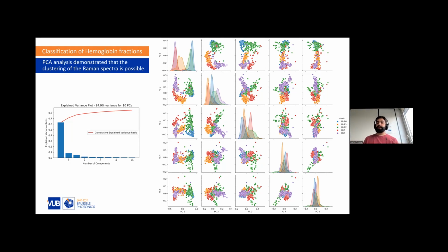For example, if you have a spectrum which has 1,000 data points in it, it gets those 1,000 data points and then translates them into some components called principal components that correspond to the variations in your data, the variances that you have in your data. Now, in those translated coordinates, how does my data look?